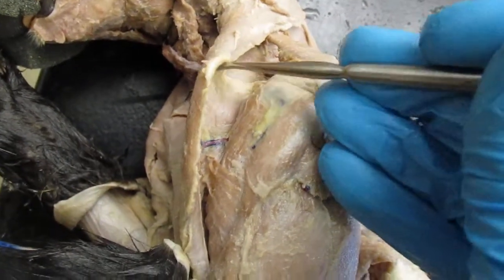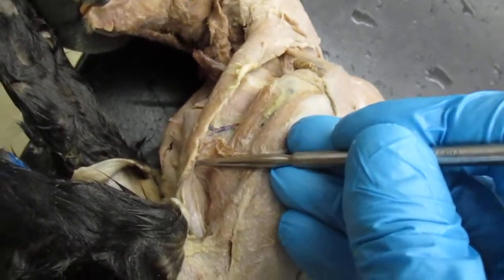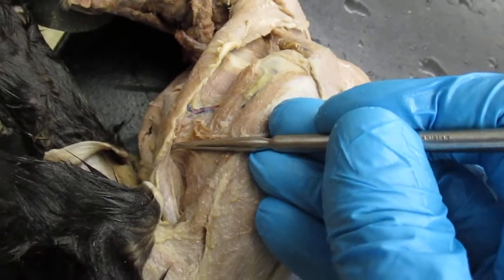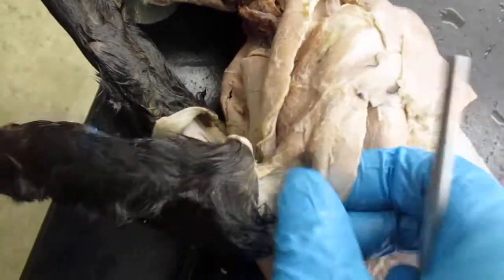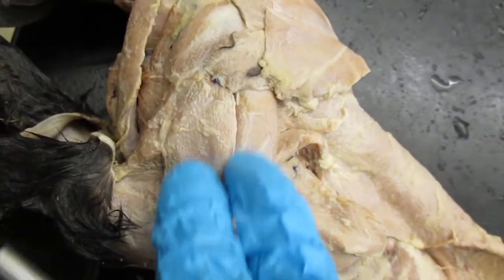And then once you get past that, it turns into the clavodeltoid or the clavobrachialis. Clavodeltoid or clavobrachialis.